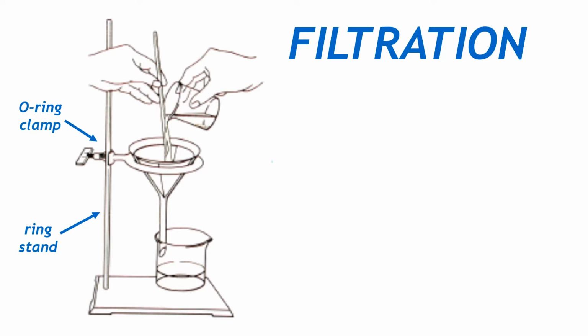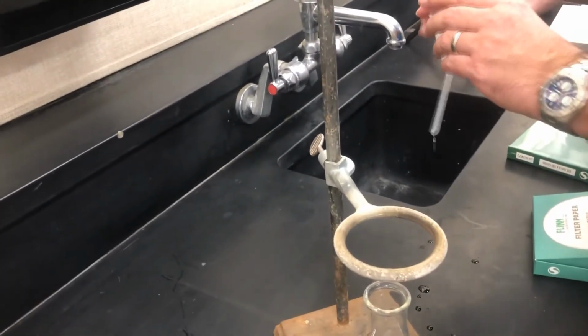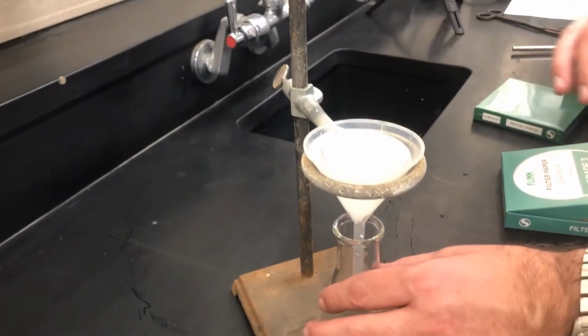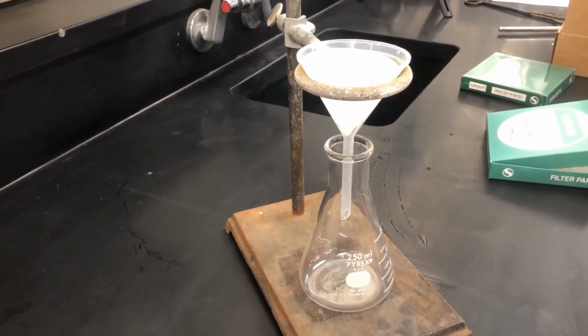The material will be drizzled through the funnel with the filter paper cone, and some material will make its way through. That liquid is called the filtrate. To make sure that the filter paper cone adheres to the funnel, we make it slightly moist. It is inserted into the O-ring positioned above the beaker or flask that will hold it.